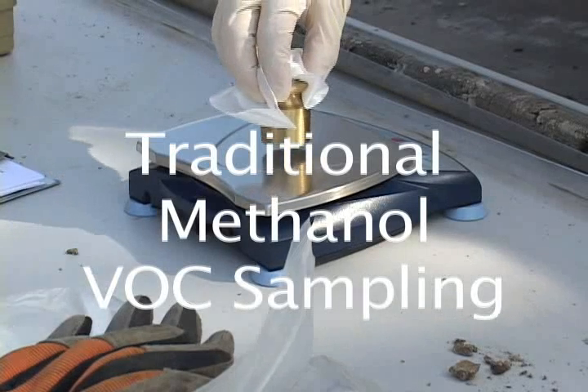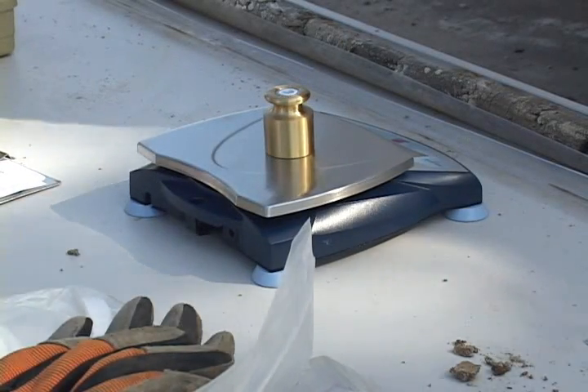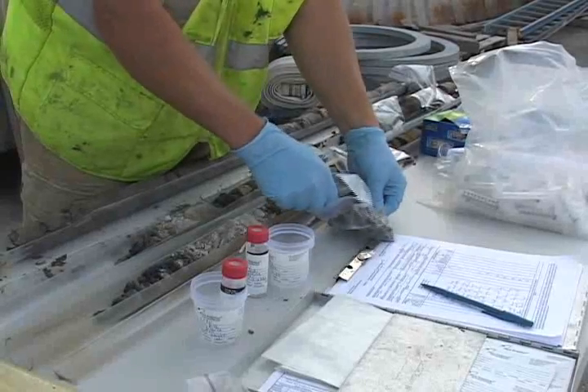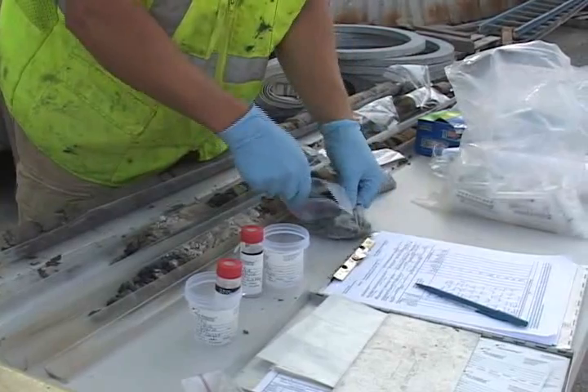In the second part of this series, we will demonstrate soil sampling using traditional methanol preservation. Here you can see a calibration weight on a balance, because the methanol vials the field crew uses have to be weighed prior to use.